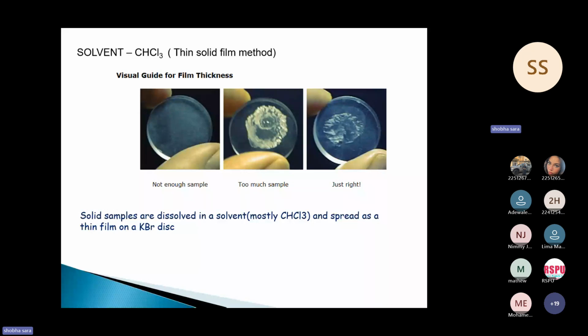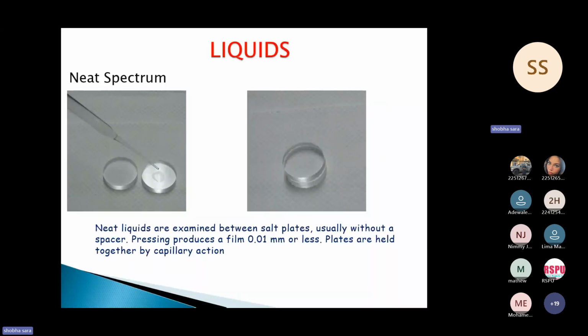Next is for liquid samples. If it is a neat liquid, that means one that is not mixed with any other solvent.